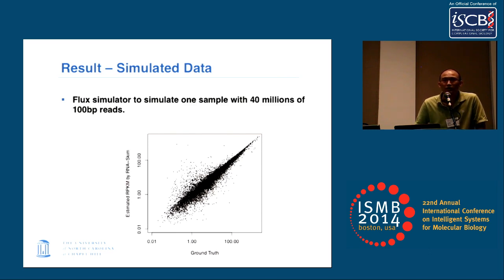Related question is how do you deal with the feature overlap? Let's say the gene overlap or the transcript overlap. I mean the same region could correspond to different genes or transcripts. How do you assign the reads in this situation?